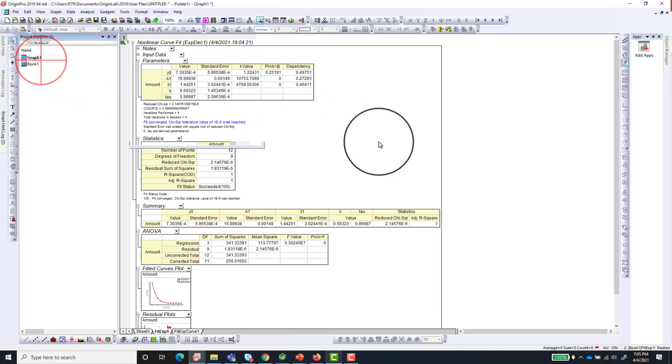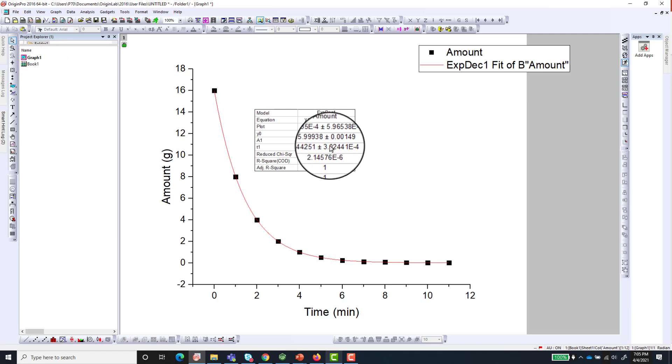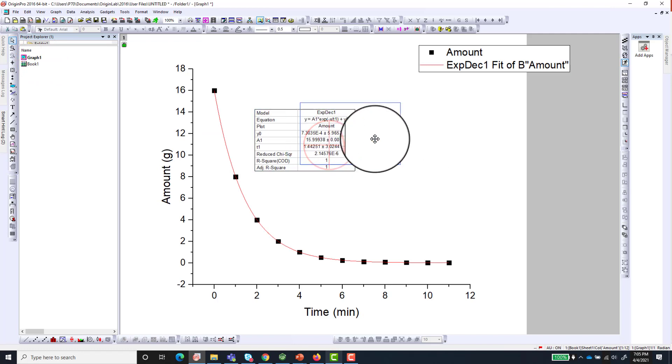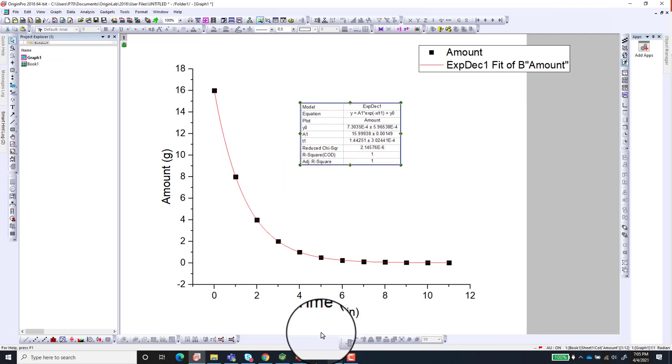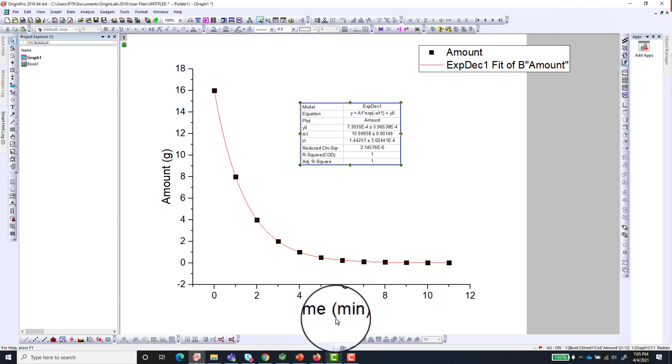So go back to the graph. And we have our curve fit to the exponential decay function. So this is how to fit your graph to exponential decay.